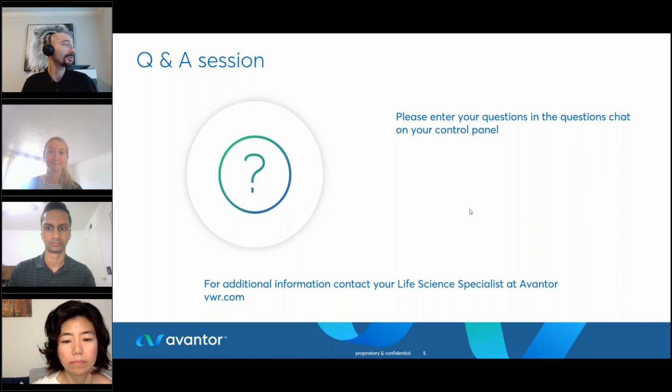Perfect, thank you. And the next question is related. Maybe you can take this one, Aaron. How many plasmids would you be able to sequence on a single flow cell?